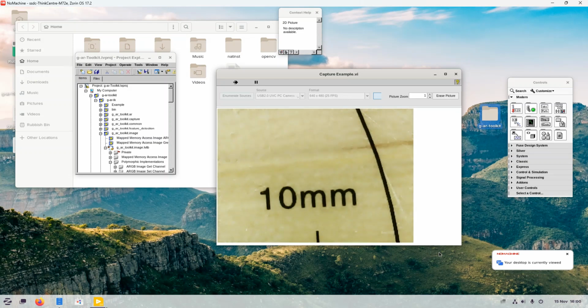Yeah, so it's very, very powerful. This is a nice, cheap piece of hardware. I mean, the microscope is £15, but you can get little USB webcams for next to nothing. And this, I think, should be the basis of our next CTI training course.